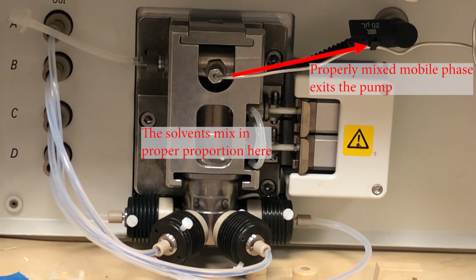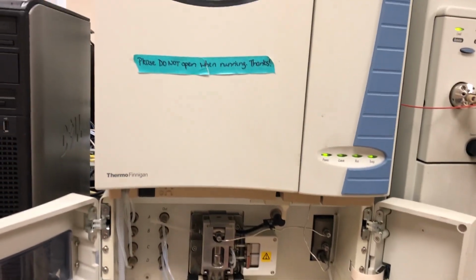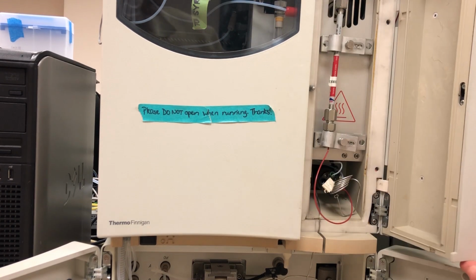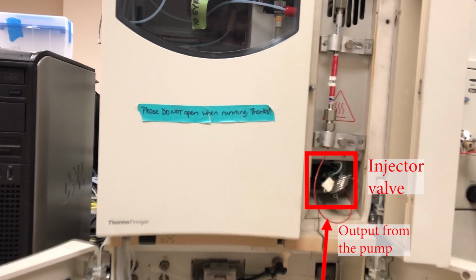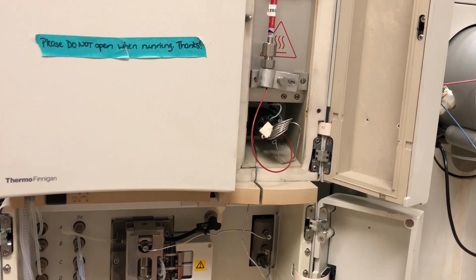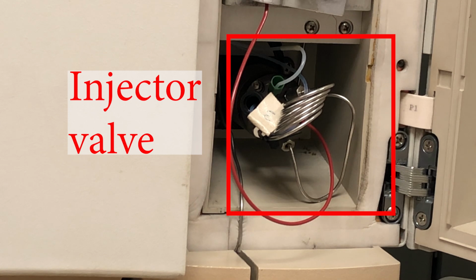So let's get back to our plumbing here. And we had the pump. We had the mobile phase exiting the pump. We talked about how you can mix that up. Now let's look at the rest of the system here. We have the mobile phase being pulled up into that little black guy there, that little injector valve. The output from the pump goes into the injector valves. Now, valves are not the most glamorous things, but they are important, and we need to take a look at them and how they work, and they can be a little bit confusing.